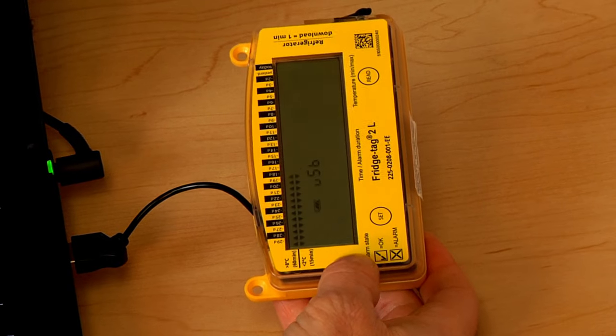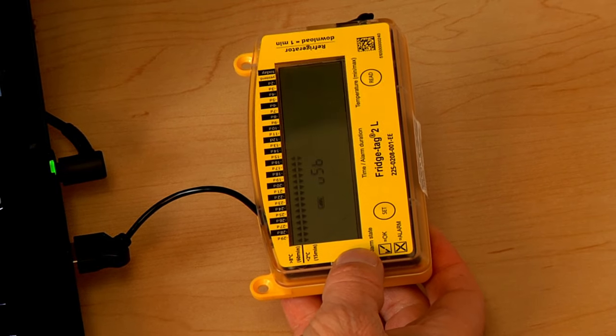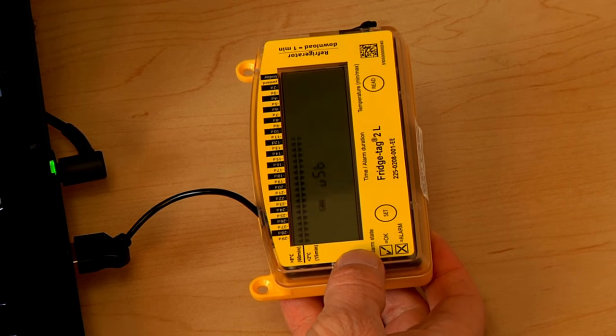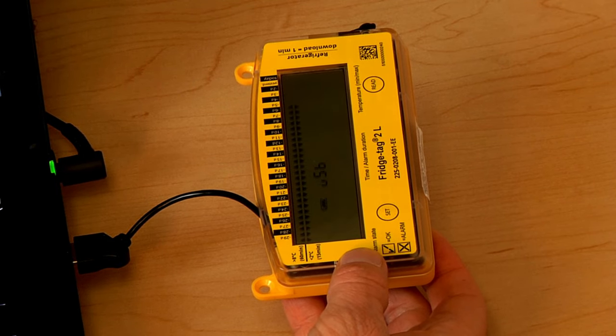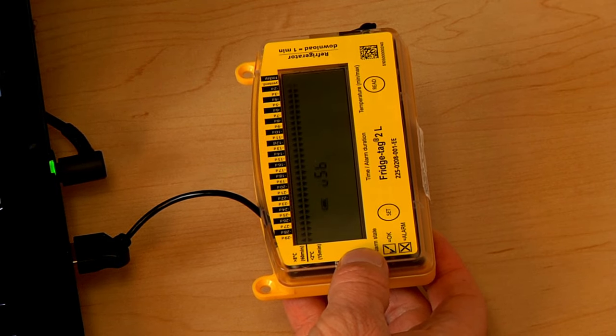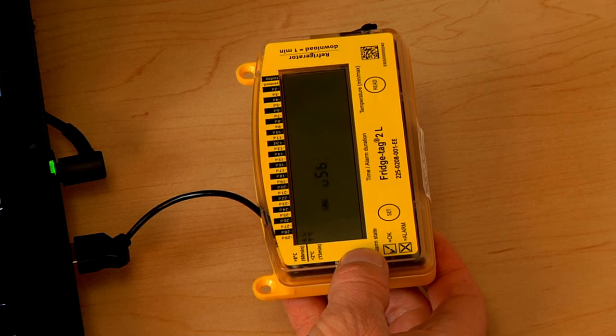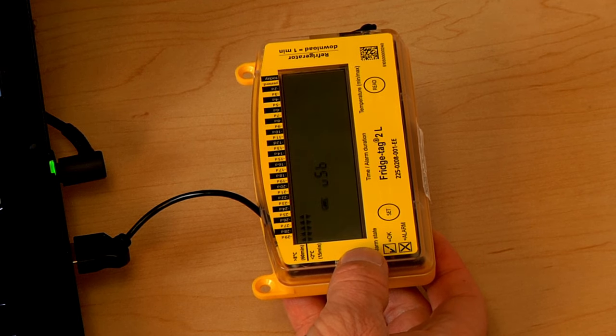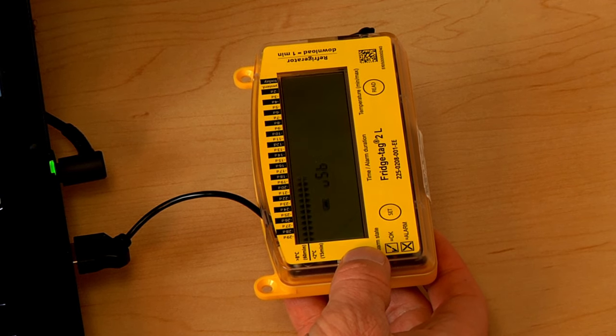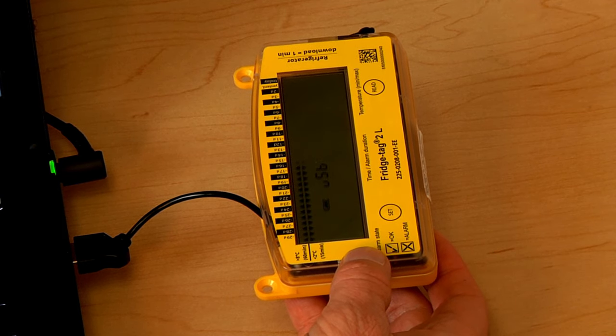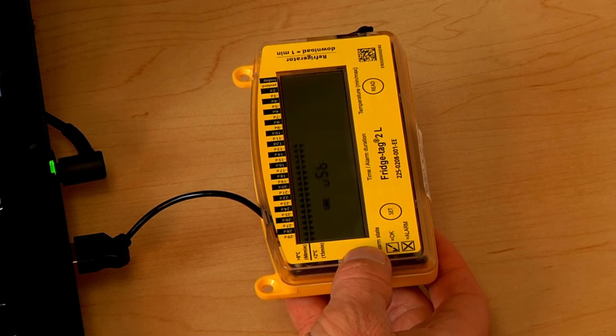If it's a Fridgetag 2L, the screen will show that it is actively generating the report. The Fridgetag 2 screen goes blank and the report is generated nearly instantly.